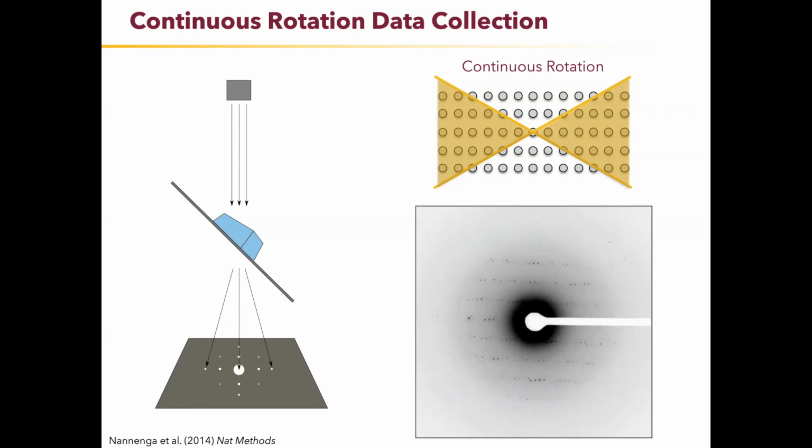Kind of the same way that an X-ray diffraction pattern, all the information you get from a single pattern, now you can build that up with multiple patterns from electron diffraction. This was sort of the big key to making MicroED work: collecting multiple diffraction patterns.